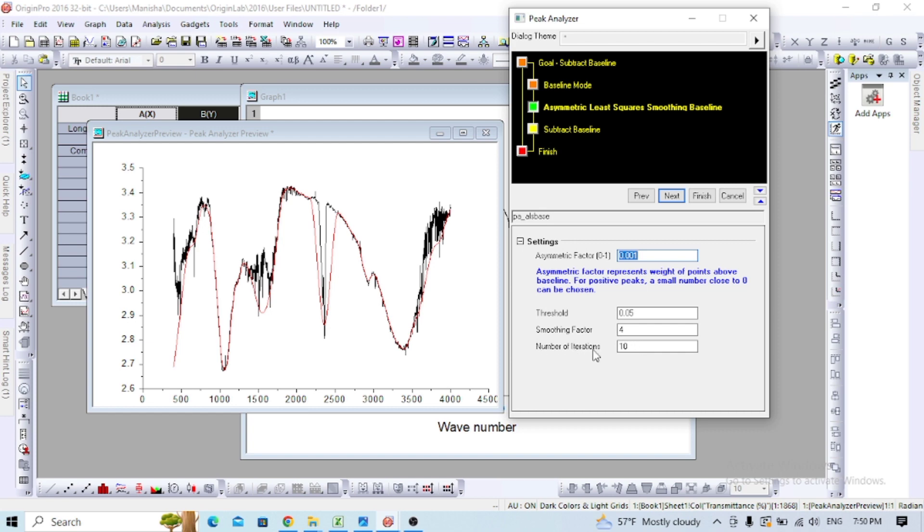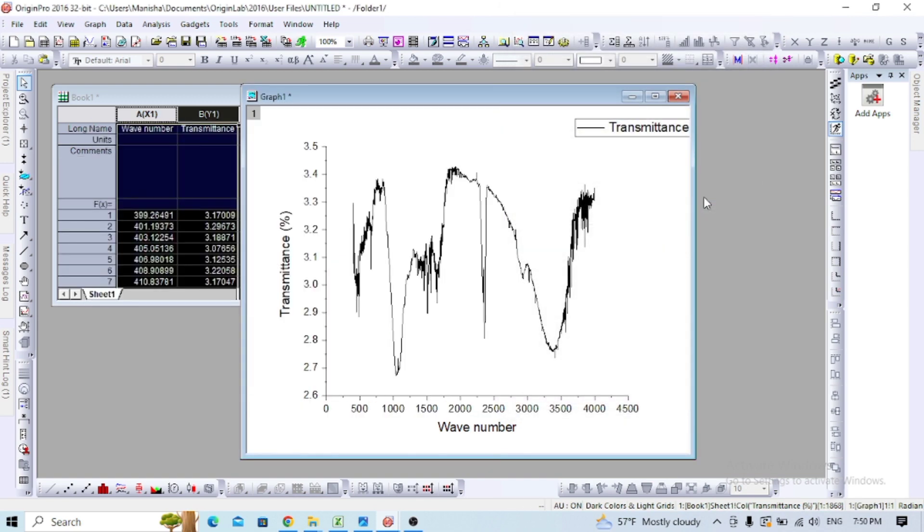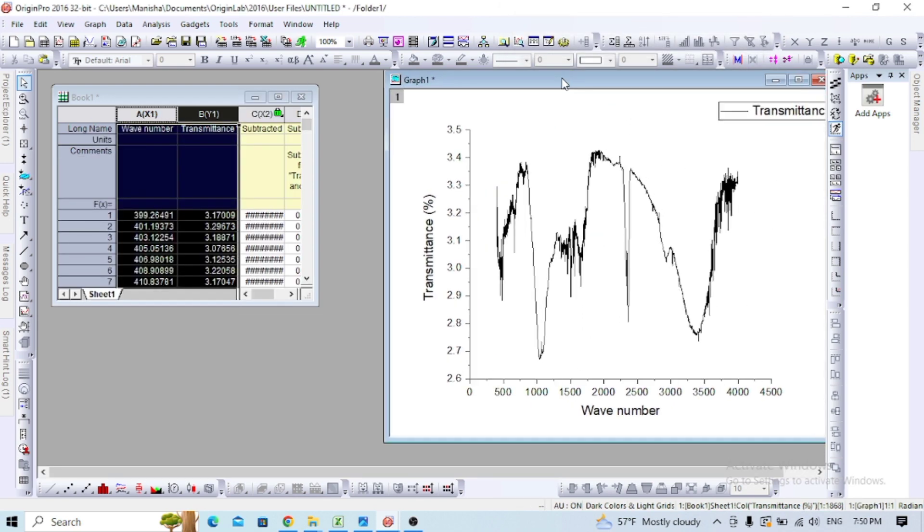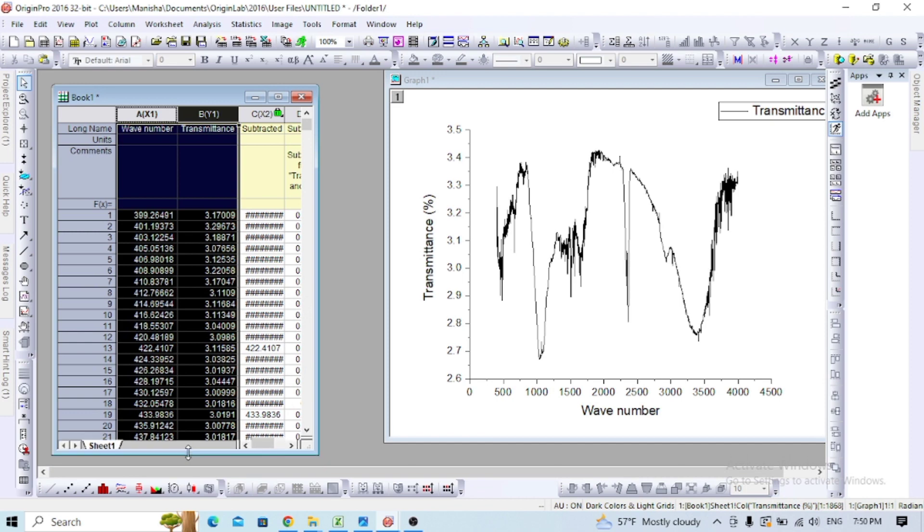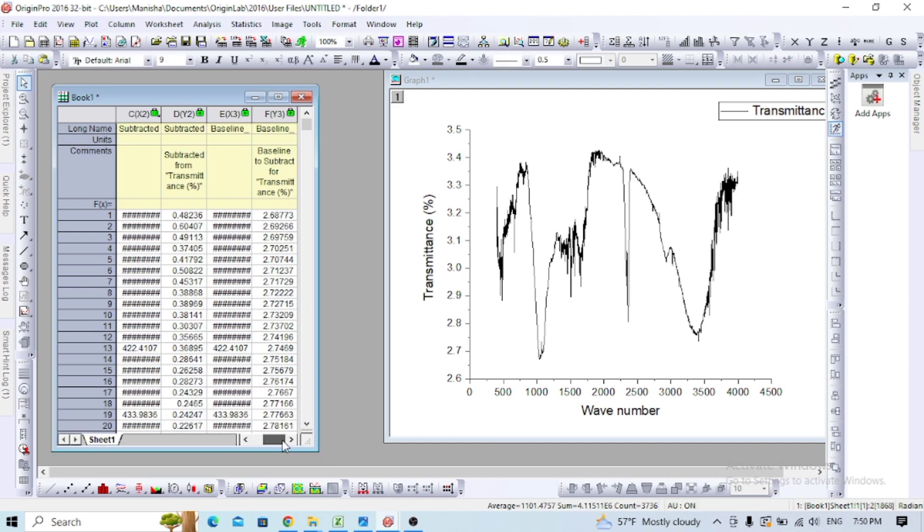I'll keep the same settings, so let's proceed. This will create a new file, so let's finish it. Now you'll get the baseline subtracted data.